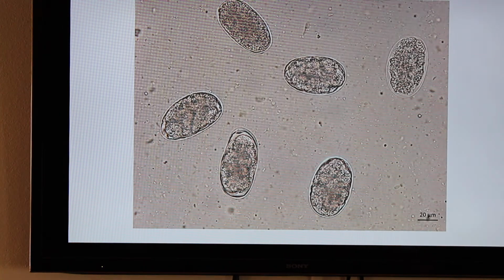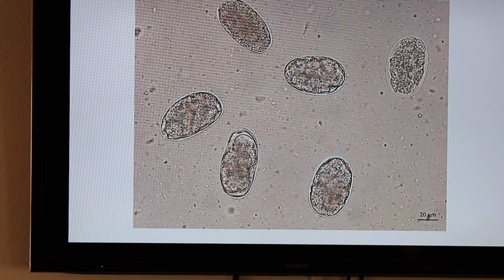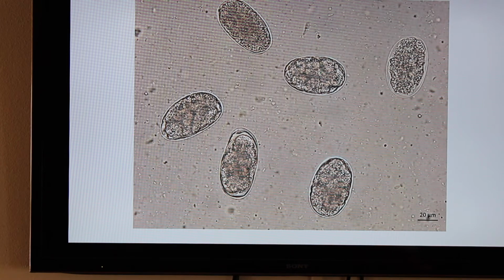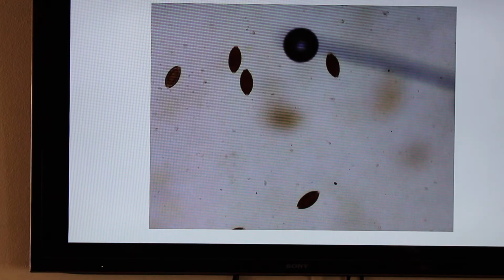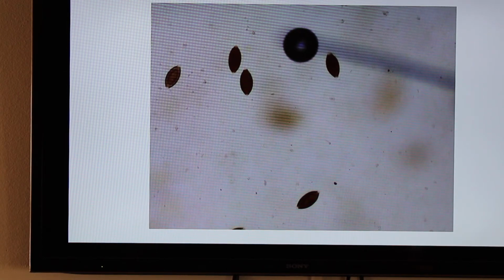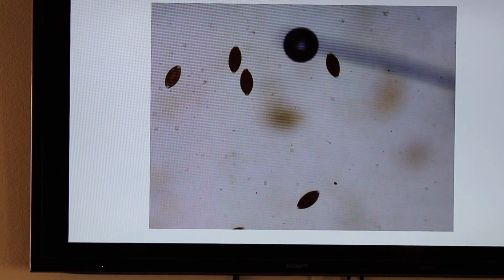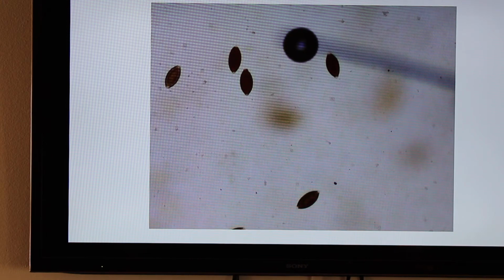This is a closer up picture of our Ancylostoma or hookworm. So again, it has a smaller shell, but some bunched up material inside. This image is our whipworm, or Trichuris vulpes, and then of course one of our fun little air bubbles again. The giveaway to these guys is the football shape and then our bipolar ends.